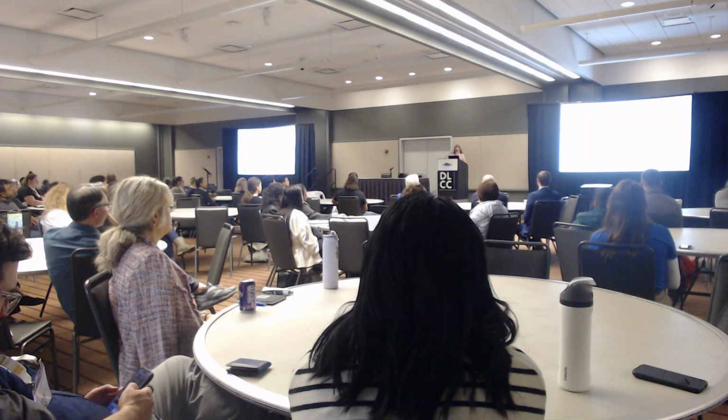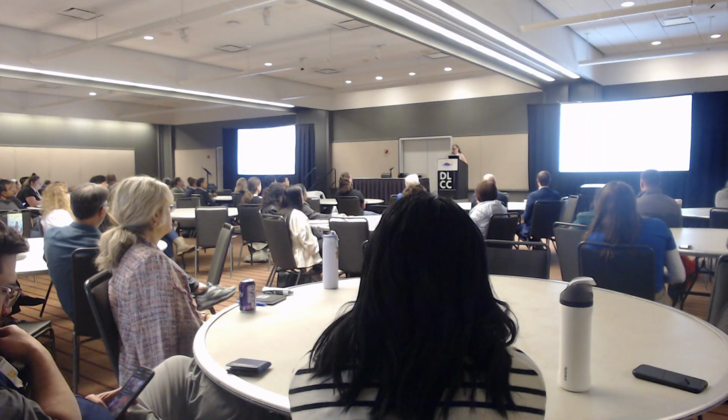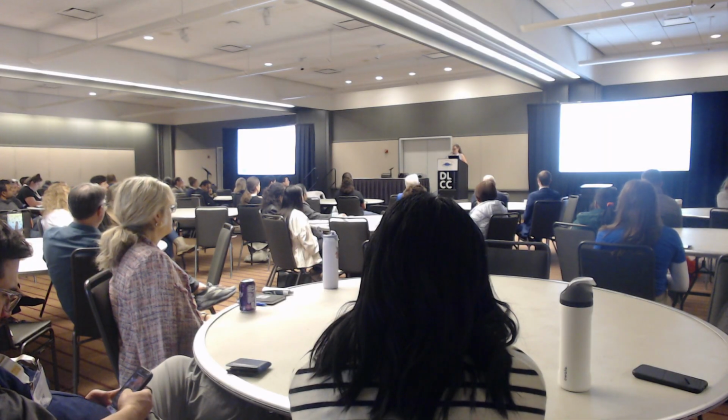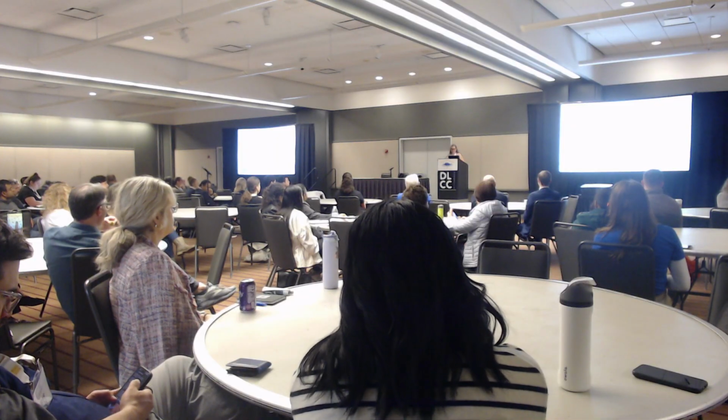So it has to have a scientific fit. People ask me to test some assays. I'm like, no, there's no point. This is not for my core. There's got to be a sample context. I'm very careful about choosing which investigator to approach, what type of samples I will test, depending on the assay or the kit that it's going to be.